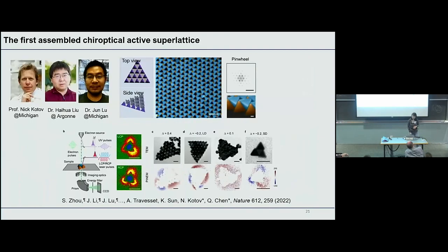In fact, we're able to utilize one of the deformation modes shown in this animation here to collapse what you just saw into a chiral symmetry breaking lattice as shown here. If you look at this SEM image of the superlattices, now the triangles are all twisted against each other. And the twisting is actually happening because we're effectively compressing this lattice to decrease the void space.